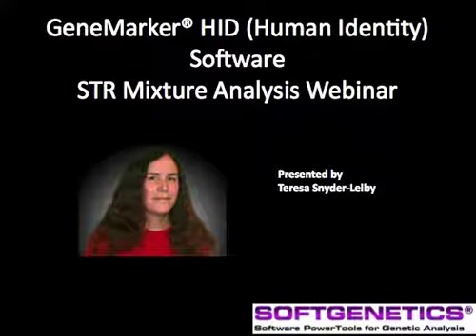Welcome to today's GeneMarker HID Human Identity Software Short Tandem Repeat Mixture Analysis webinar. GeneMarker HID software is an expert system used by forensic laboratories for human identification. During this webinar, we will use STR mixture data from the National Institute of Standards and Technology website to walk through all of the mixture analysis options in GeneMarker HID. Please review the introductory GeneMarker HID webinar for details on user management, importing data, setting analysis parameters, reviewing results, editing results, audit trail, and reporting options.